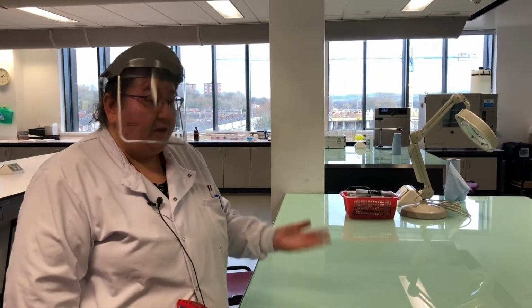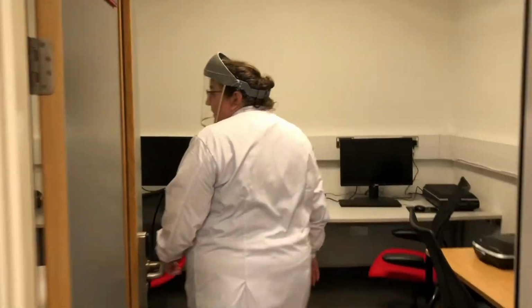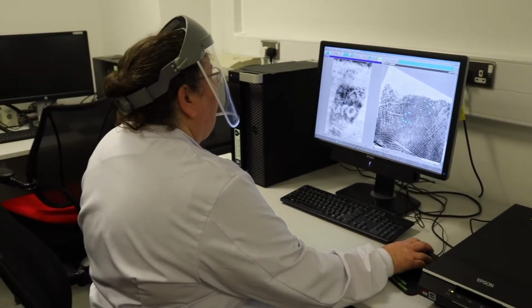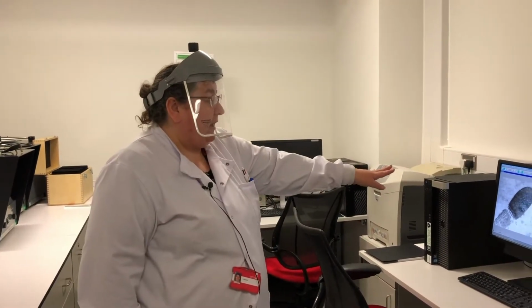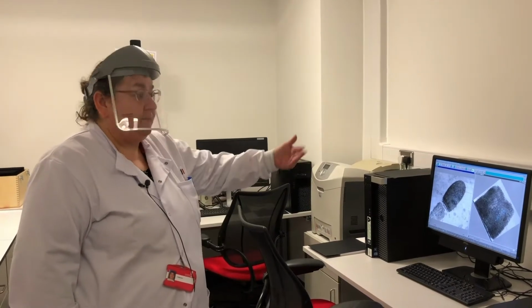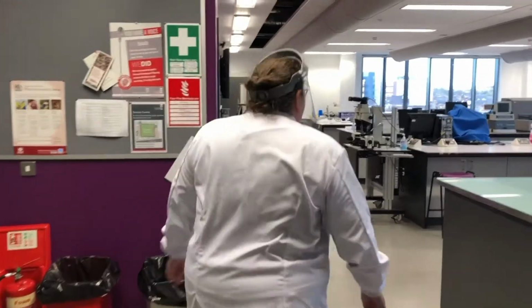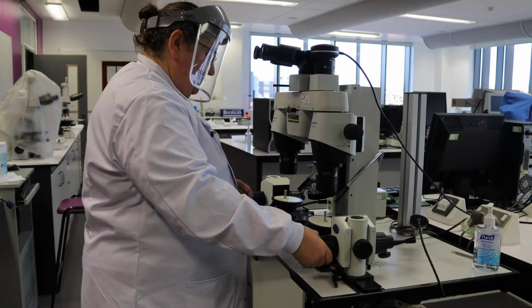Once we've got a viewable image, the students would then come into our AFIS room, which is our automated fingerprint identification system. They would scan in their image and put in key points so that we would then get a match against a known perpetrator in the system. It would highlight the key minutiae in the fingerprints so that they can then identify if they've got a victim or a suspect. Once they've done that, they would write up their report and follow through to the crime scene house with that evidence.